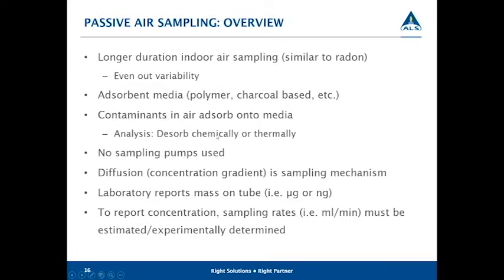With TO15 testing in the canisters, the maximum sampling time that you can do is 24 hours. So if you have a site where it would help you to understand what's going on over a 2-week span, as opposed to a shorter time frame of 8 or 24 hours, these passive sampling techniques are able to help you achieve that.